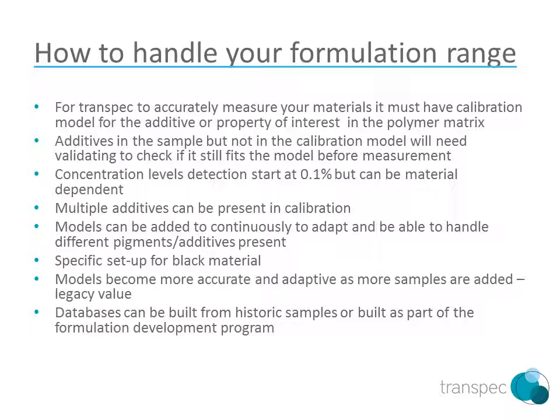The models will become more accurate and robust as more data is entered into them. Thus, as more samples are added, a legacy value is gained. The database can also be built from historic samples or as part of a formulations development program, so that building a model requires as little resource as possible.